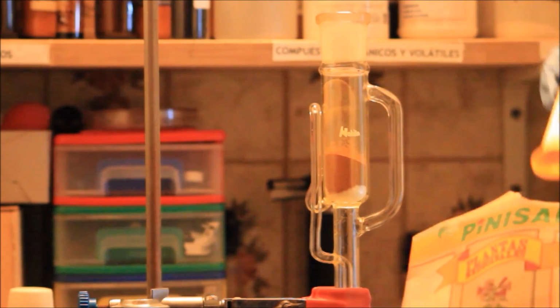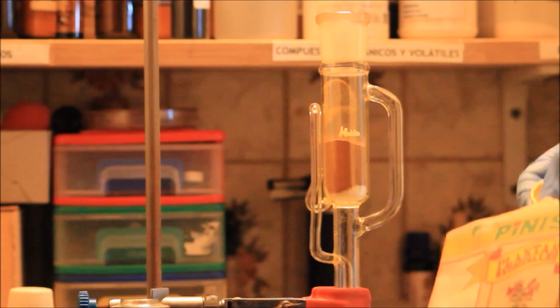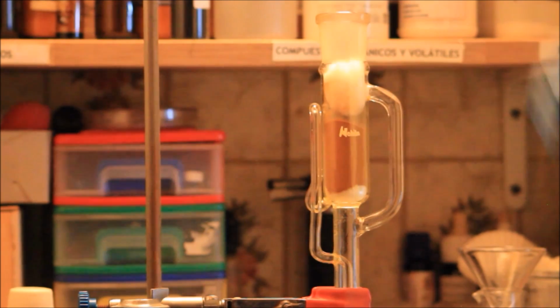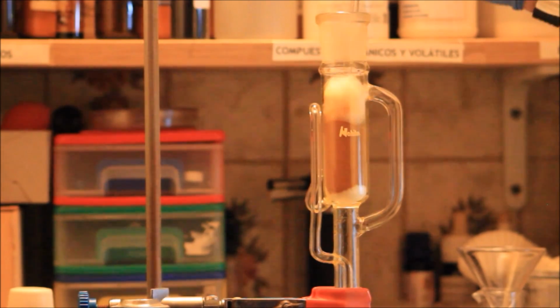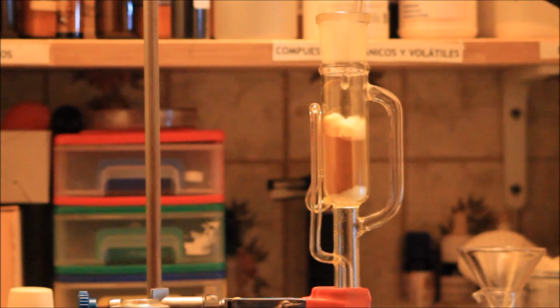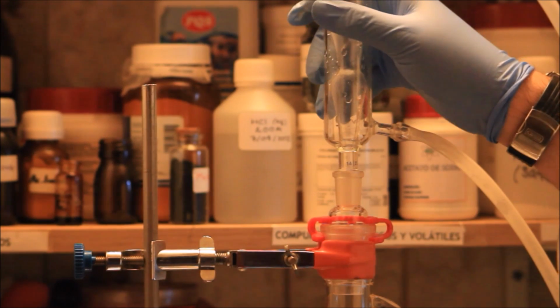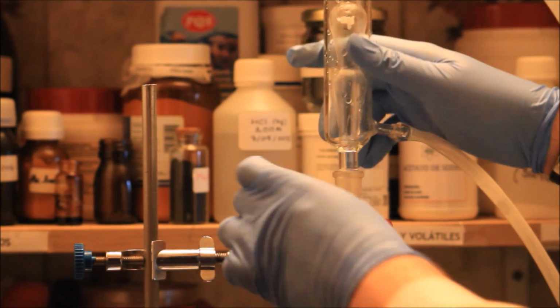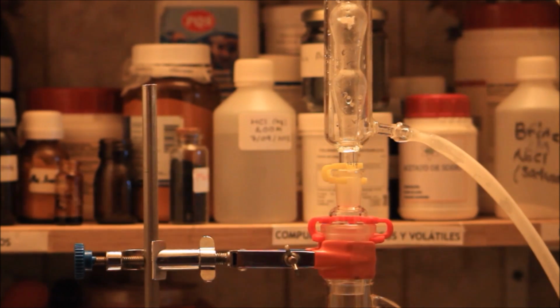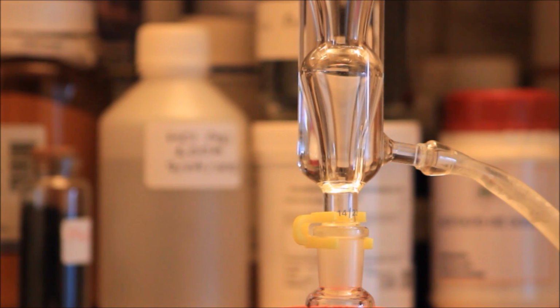Now, 10 grams of turmeric are packed into the Soxhlet extractor. Finally, another cotton ball is placed on top of the turmeric. Now the reflux condenser is attached to the upper part of the Soxhlet extractor. The water flow and the heating mantle are then turned on.